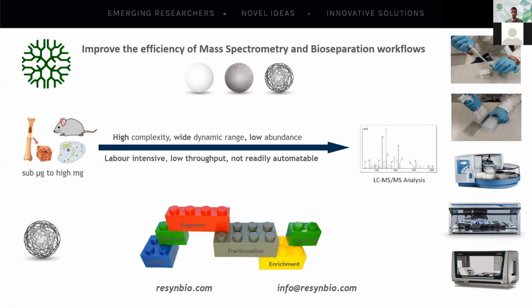All of this must be underpinned by our thinking that all the workflows need to have the principles of robustness, high throughput, being able to be automated, as well as being open. What I mean by this is that we don't want to have any hidden buffer components, so everybody understands what the mechanisms of action are, and you can then optimize your workflows further where and if needed.